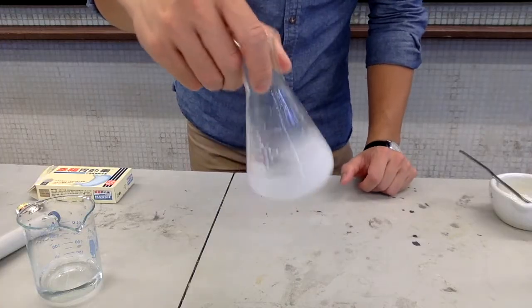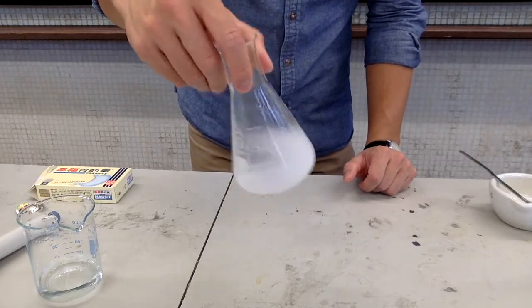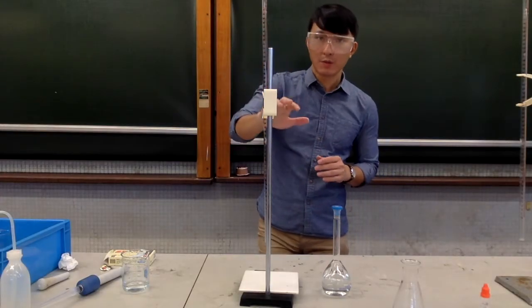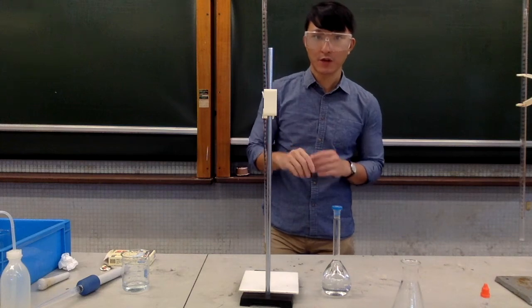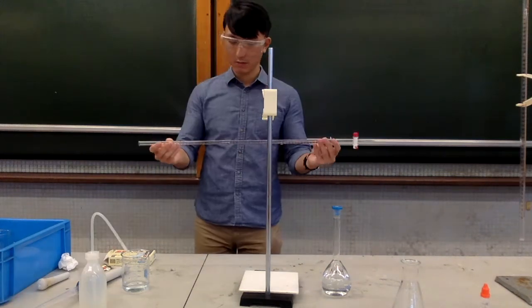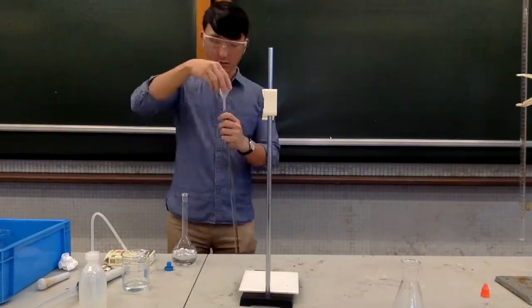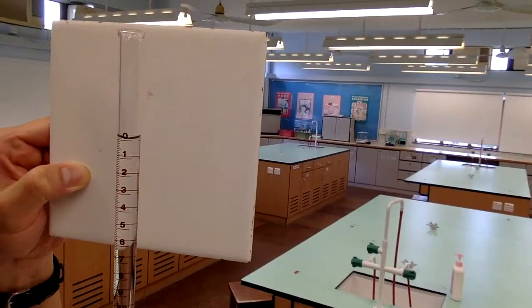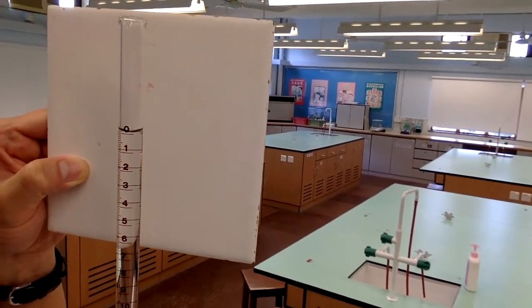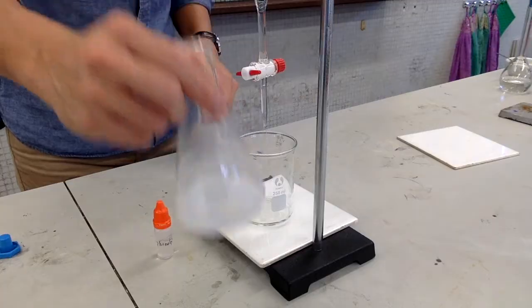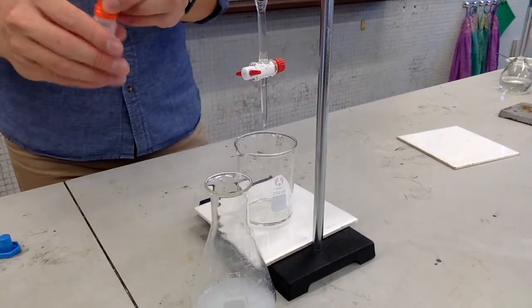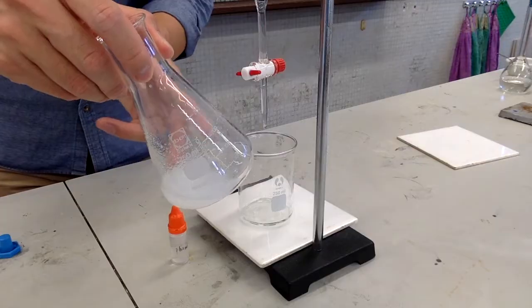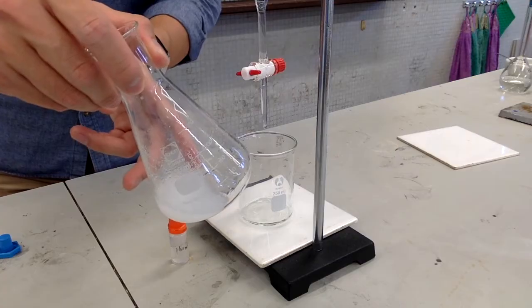Swirl the mixture to make sure that all the aluminum hydroxide has reacted with the acid. Now, wash the burette and load it with the sodium hydroxide solution for the titration. Record the initial burette reading. To the analyte, add a few drops of phenolphthalein indicator. The analyte should remain colorless because it is acidic due to the unreacted hydrochloric acid.